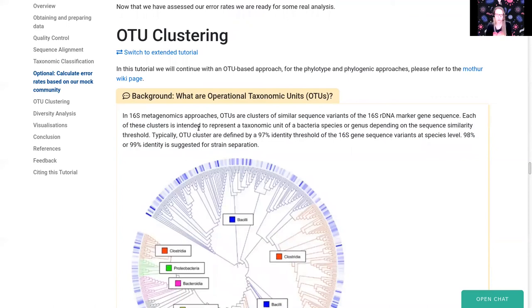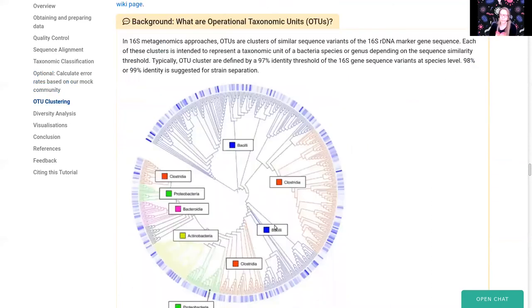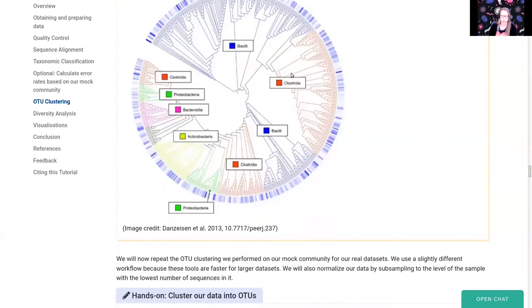The next step is OTU clustering. OTU stands for Operational Taxonomic Unit, which is clustering of similar sequences to a certain threshold. We will cluster sequences that are 97% identical — this corresponds roughly to the variation you expect for organisms from the same genus, so this represents genus-level similarity. With 16S this is usually the best resolution you can achieve; while some tools go down to species level, you can really only trust results down to genus level.